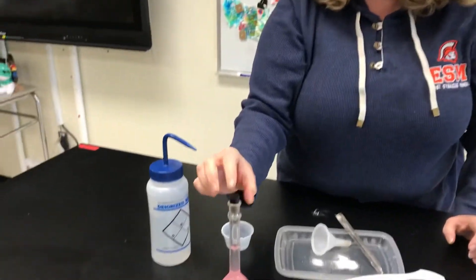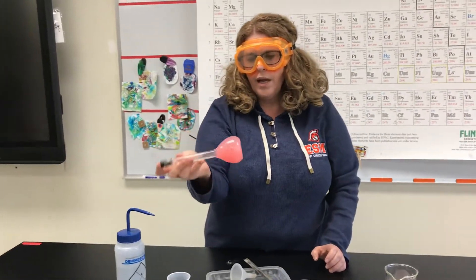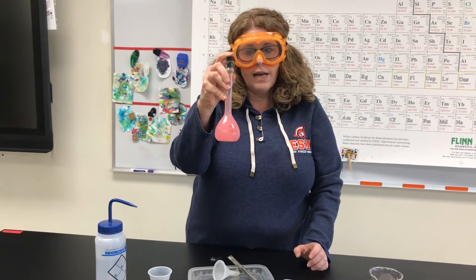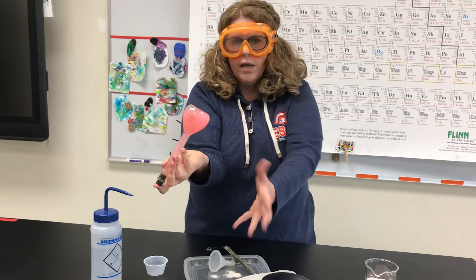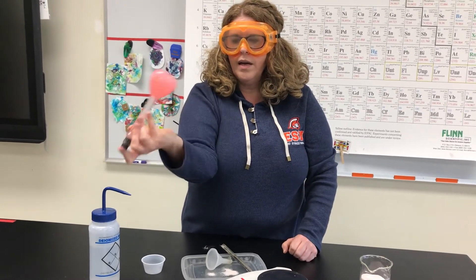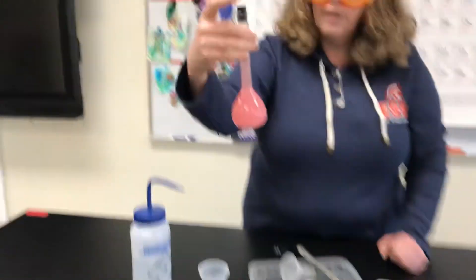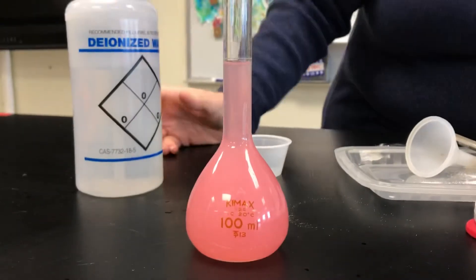So now next I'm going to take a rubber stopper — and sometimes there are ground glass stoppers for this — and I'm going to invert. This is the way you're going to stir, always keeping a finger on top of the stopper, because if we turn it upside down I wouldn't want the stopper to come out and have a lab accident. And there we have our two molar solution of Kool-Aid.